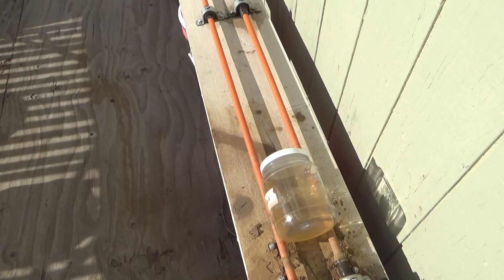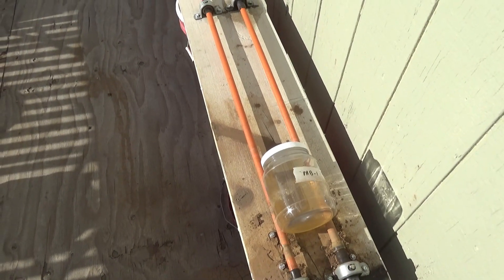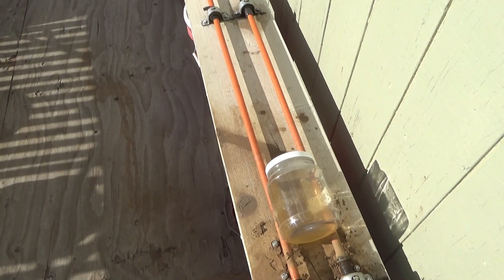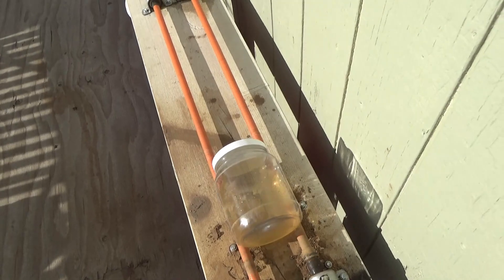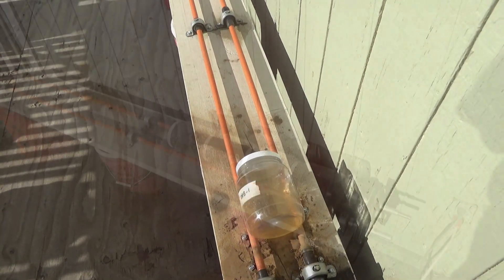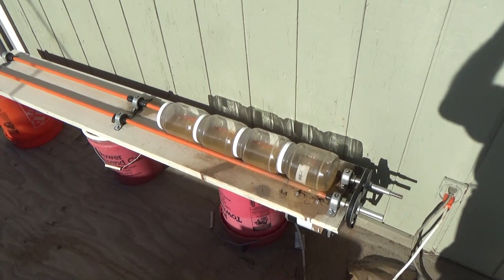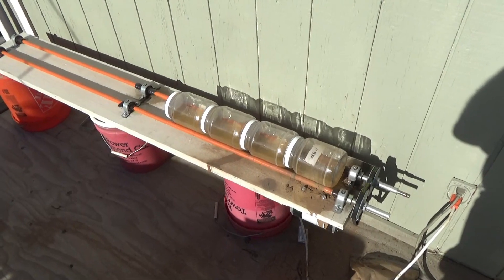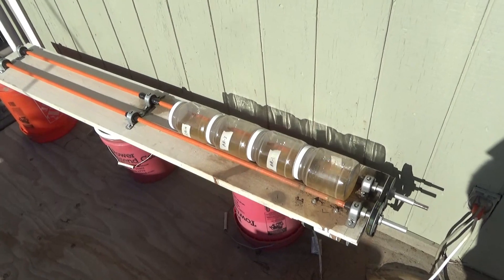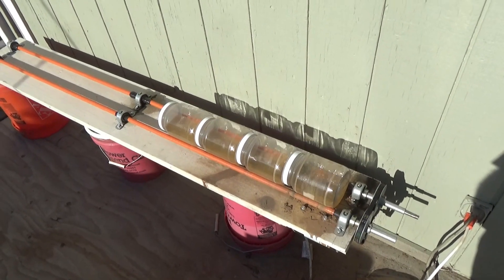We shall see what we shall see. I expect to have residual gold in solution in each one, which will give me my loading factor. I staged them five minutes apart, which will give me time to take the sample and get the next one without changing the time each one had to do its thing.